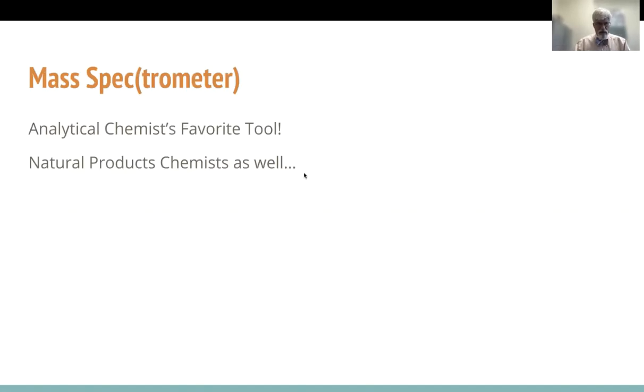Okay, so we did a little Kahoot all about nomenclature. Now we're on into chapter 3, and we begin with mass spectrometry, referred to as a mass spec.